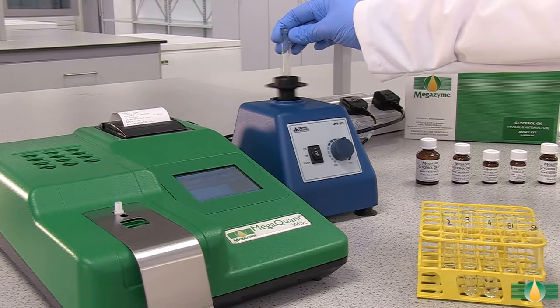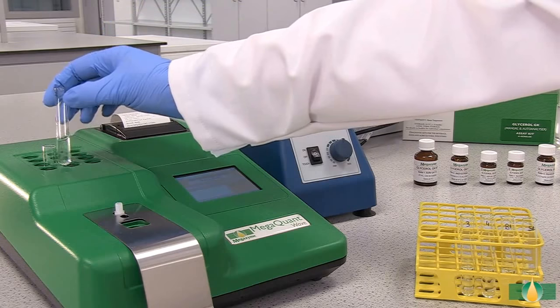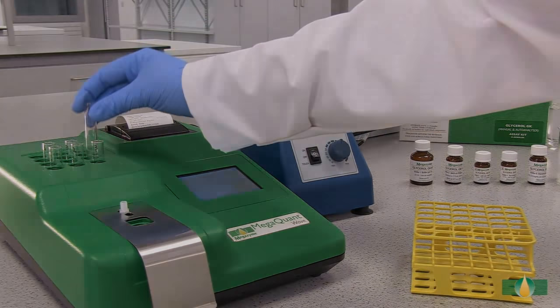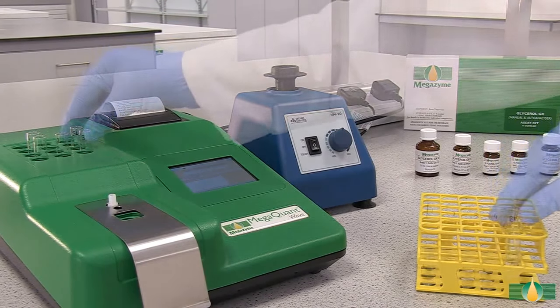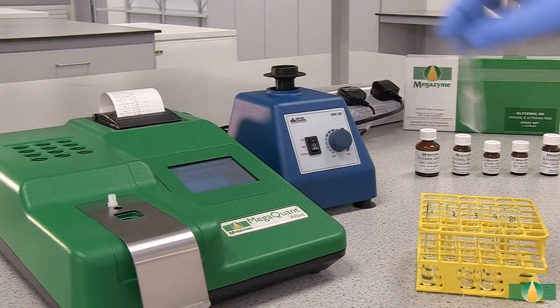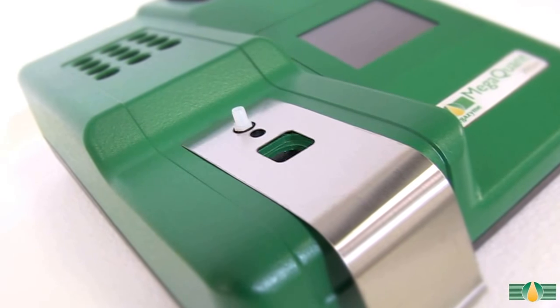When all of the components have been added, mix the tube contents thoroughly and incubate the tubes in the 37 degrees Celsius heating block for approximately 4 minutes. After 4 minutes, record the first absorbance reading A1 at 340 nm for all of the assay tubes. In this demonstration, we are using the MegaQuant Wave spectrophotometer set to read at 340 nm.